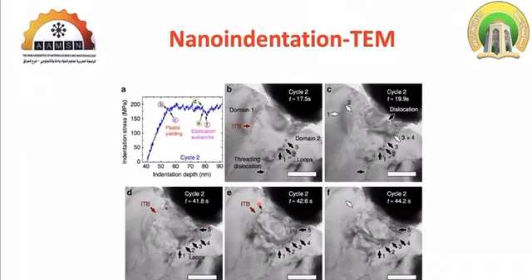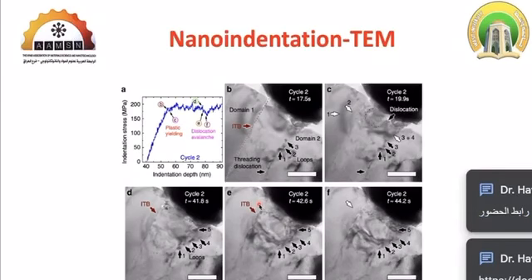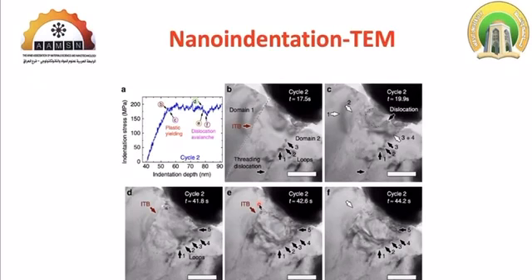Actually, I was at a conference in 2018 about using nanoindentation inside a TEM, and I met some PhD students who worked for 3 years only to get a good video of nanoindentation. All their work is applying a test like this and finding out the behavior of the material under compression. So at the end of their PhD, they produce only a video, and discuss the results of this video.